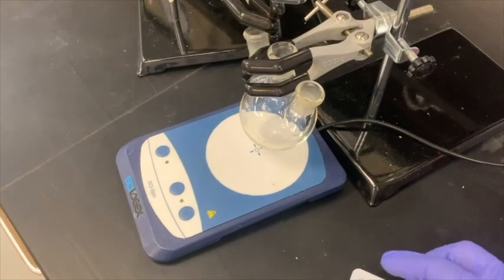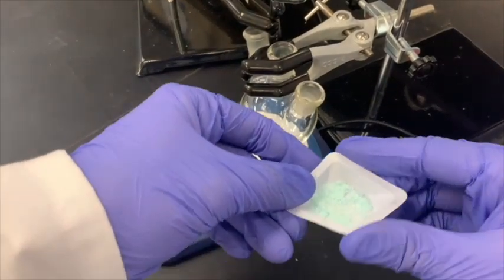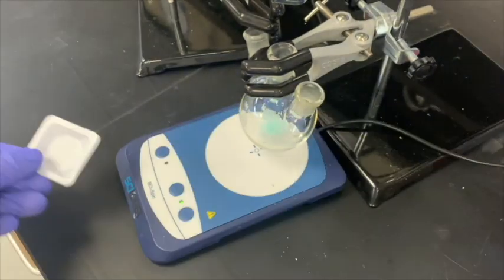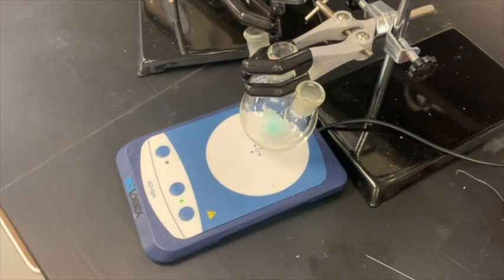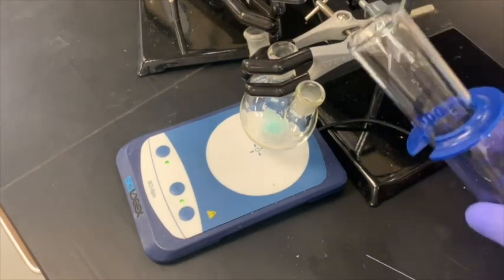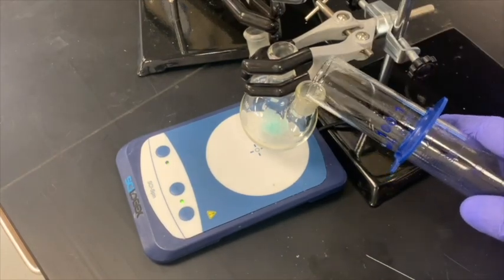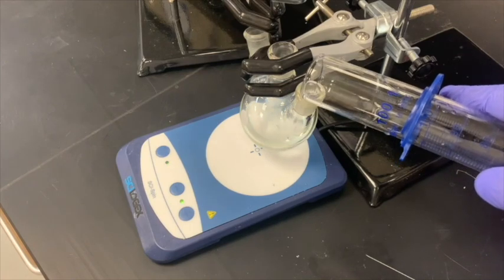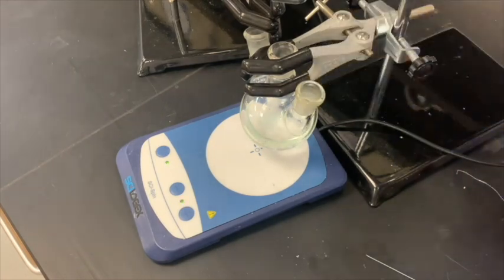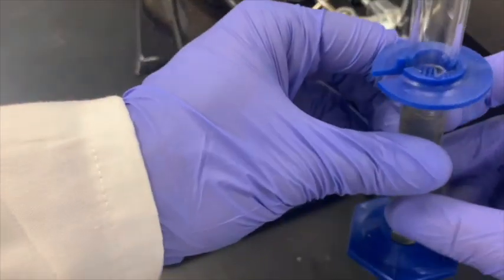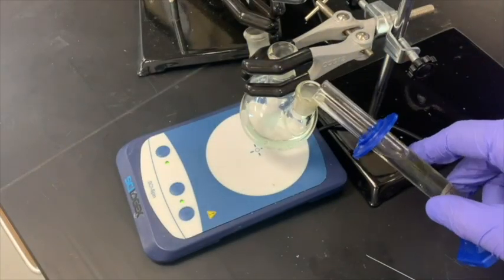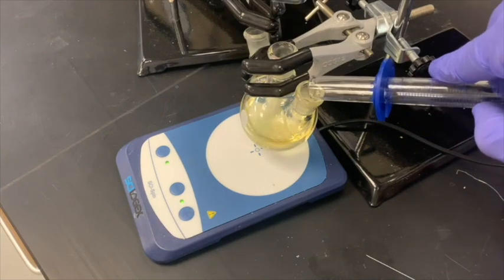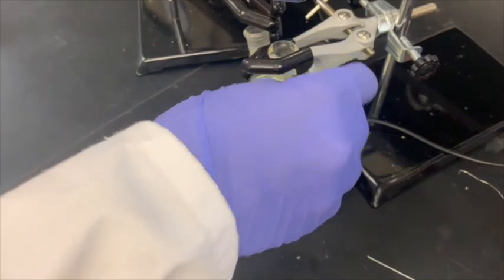This solid can be taken over to the round-bottom flask and poured directly in. Next, we will add 40 milliliters of deionized water measured out in a graduated cylinder, followed immediately by 10 milliliters of our supernatant solution, also measured out in a graduated cylinder. Once we've added these two solutions, you can also add a stir bar.